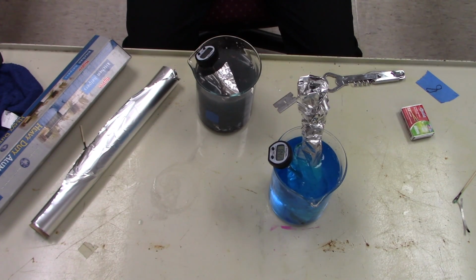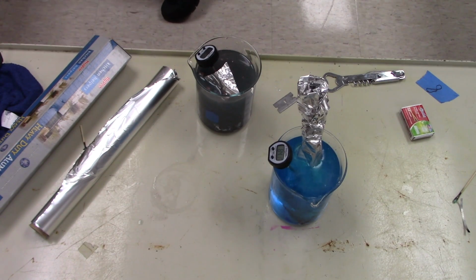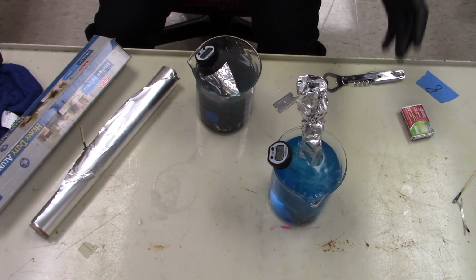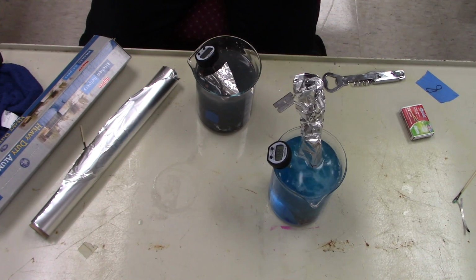And it's doing it right now. Can you see that? So it's going to start to get really hot because, kind of like before, I'm forcing the reaction to speed up. So what that does is it adds a lot of energy to the system and it heats it up. So this will get to, you know, around 105, 108 degrees or so as we let it go.